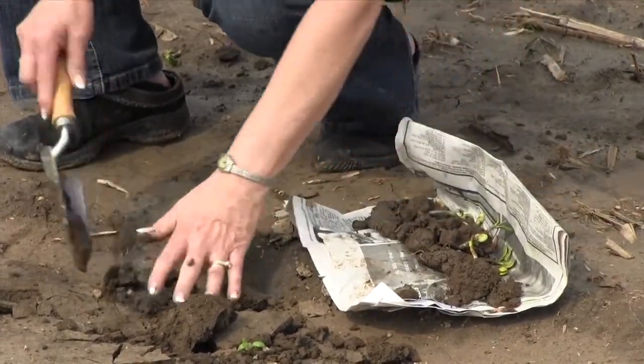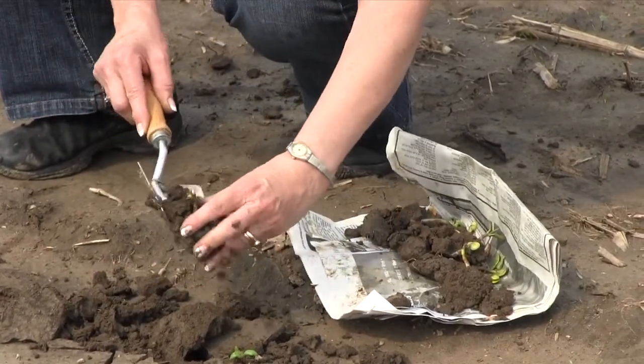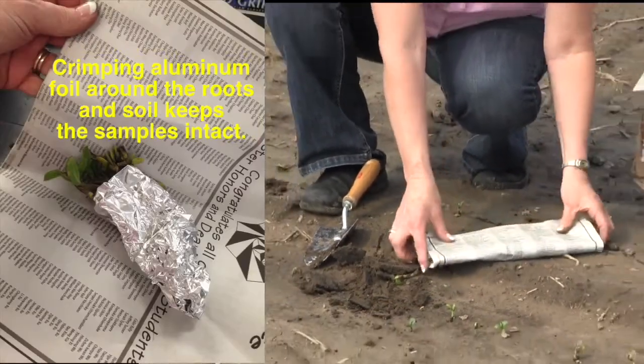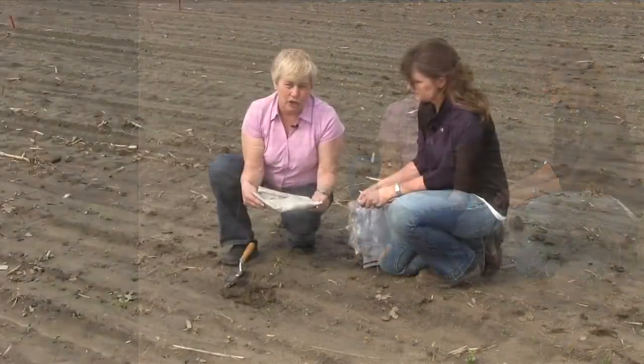So you can see here we're taking samples that are poorly emerging as well as samples that are emerging well. And then you will wrap the newspaper around the soybeans. Don't add any moisture to the soybeans because that will cause them to rot during shipment.